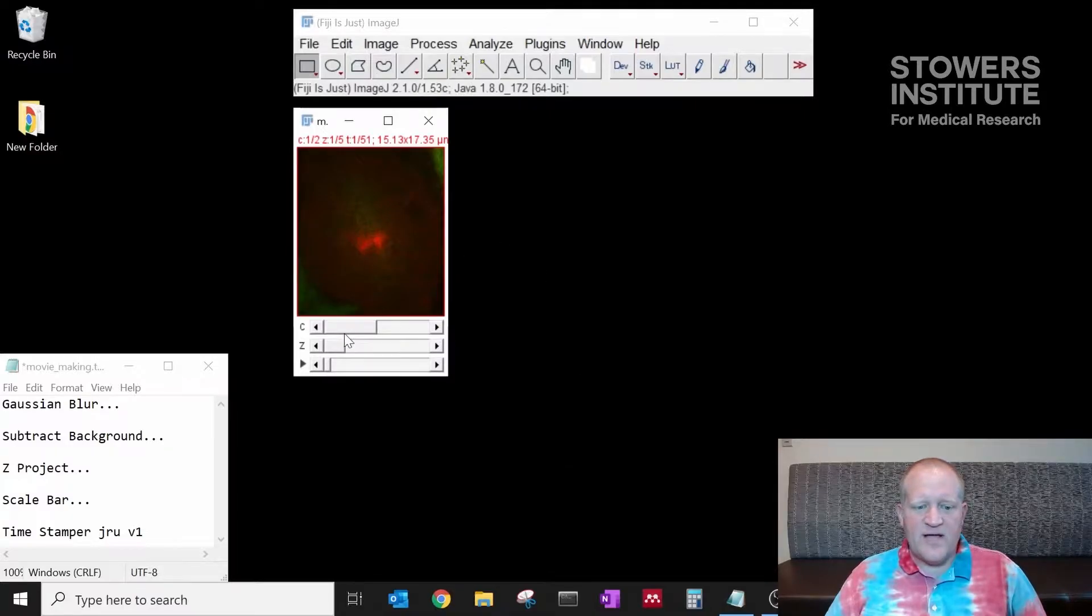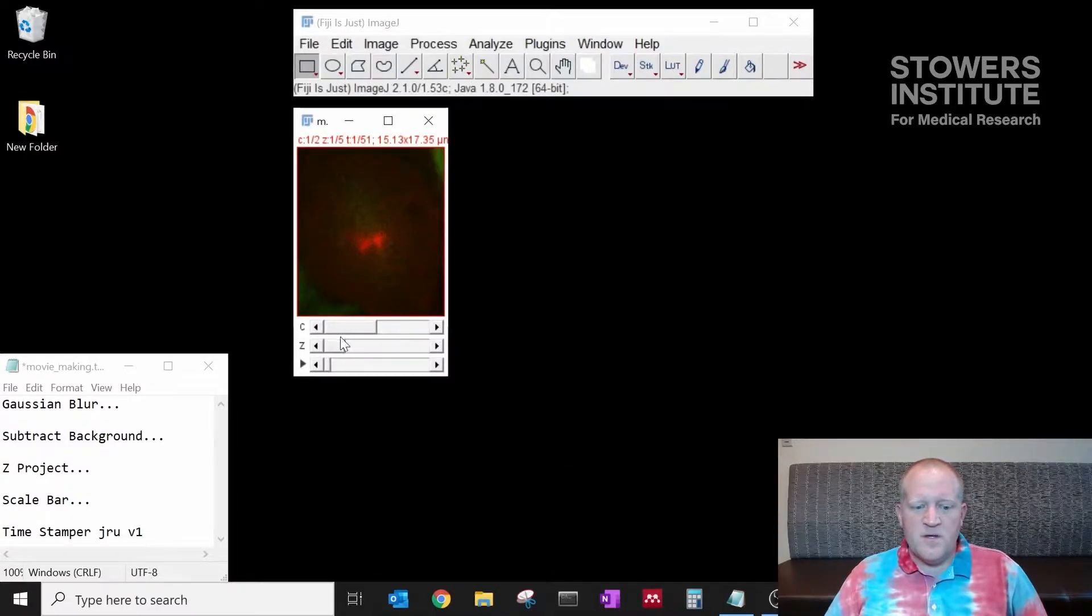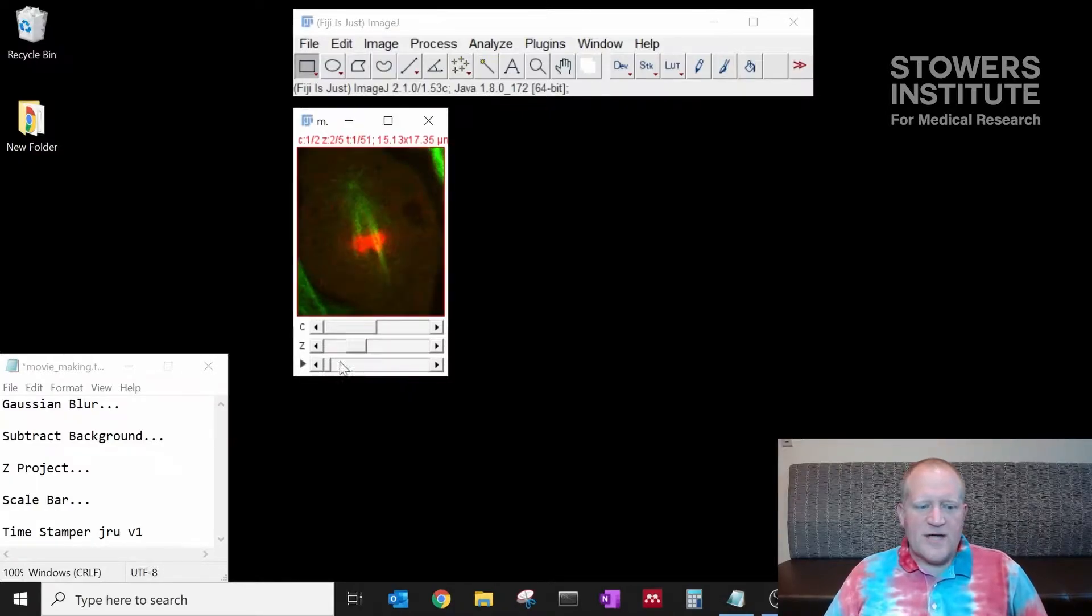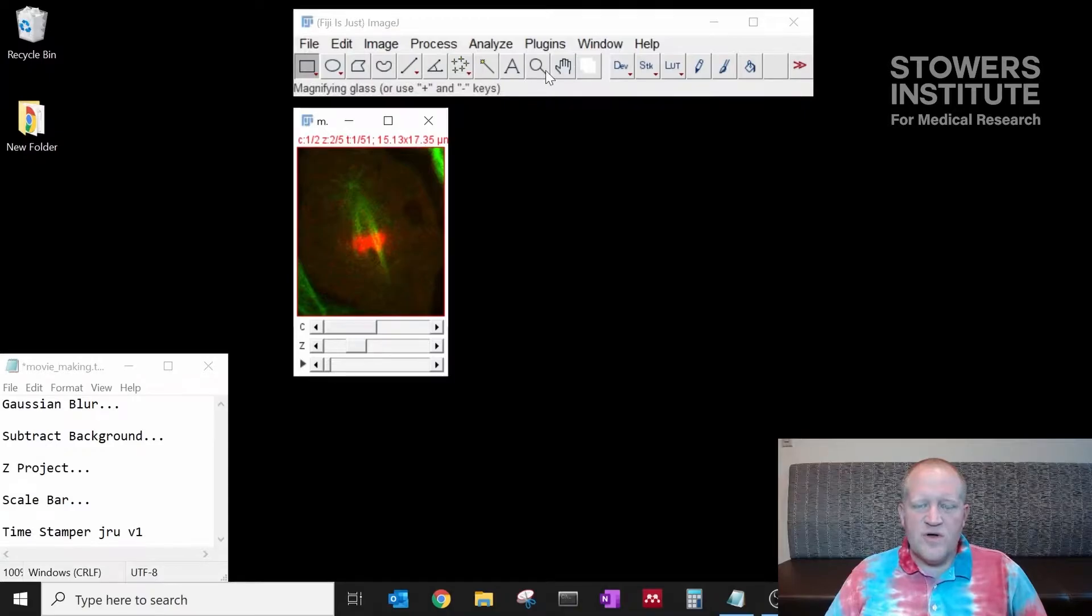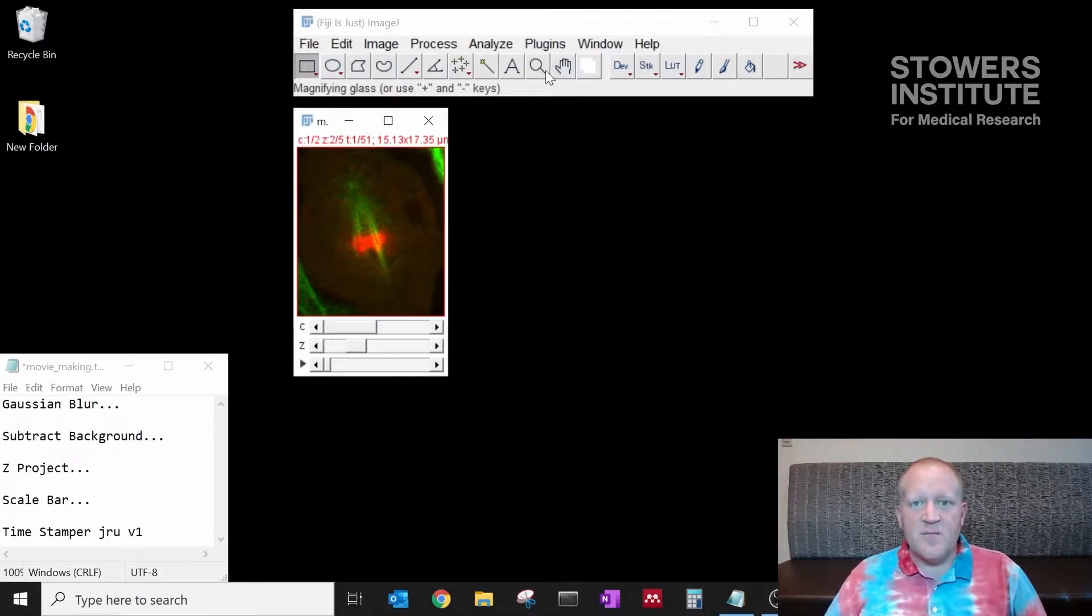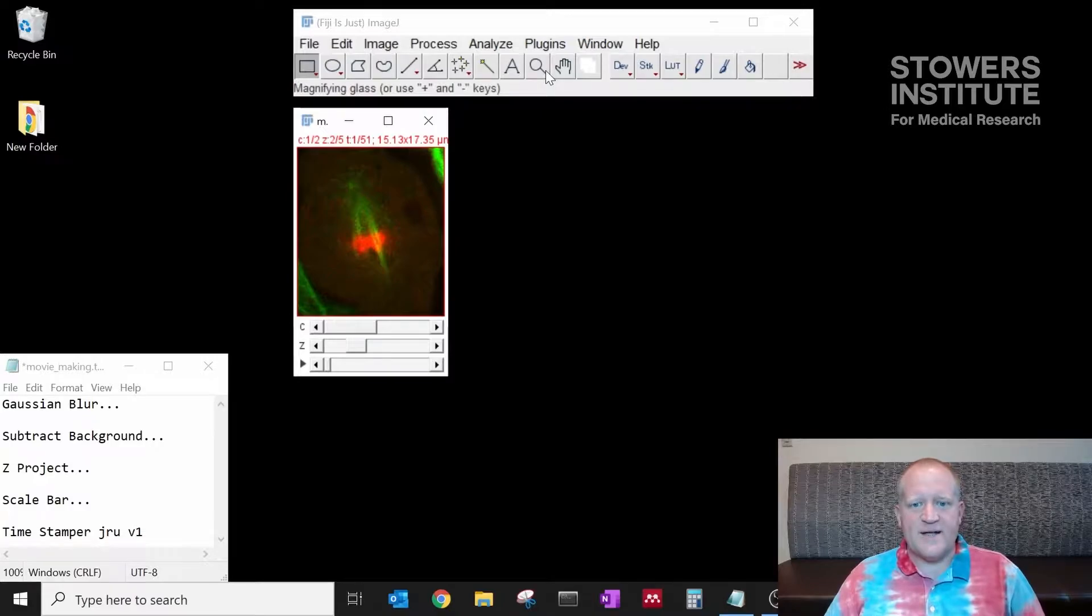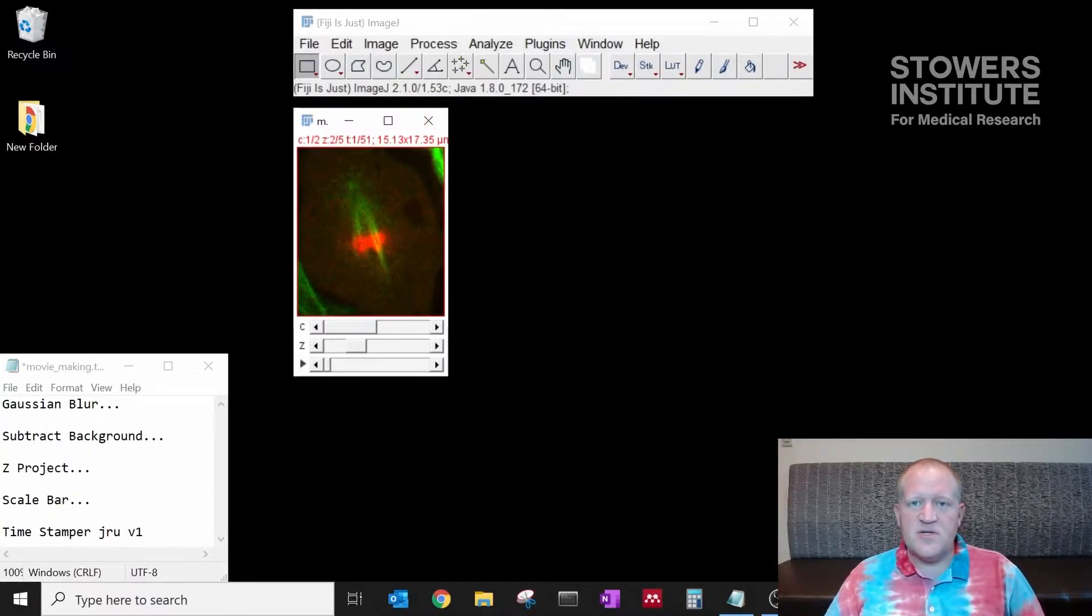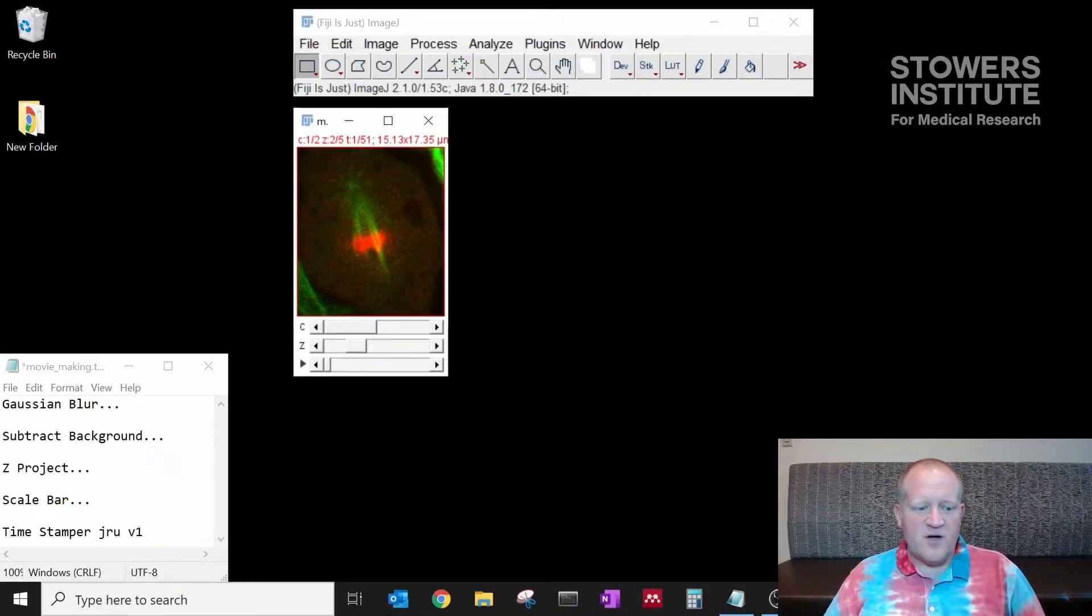Now we have a two channel Z stack time lapse. We want to make our data pretty and then make a movie from that data. I'm going to list the steps down here in this window so you can follow along.